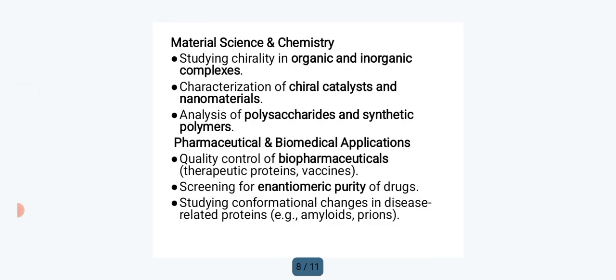Next, material science and chemistry: studying the chirality of organic and inorganic substances or complexes, and also the characterization of chiral catalytic analysis, especially for catalysis, meaning the lock and key model, ligand receptors and substrate enzymes. That is the purpose in catalytics. And nanoparticles or nanomaterials we can also characterize using CD. Next, the analysis of polysaccharides and synthetic polymers.